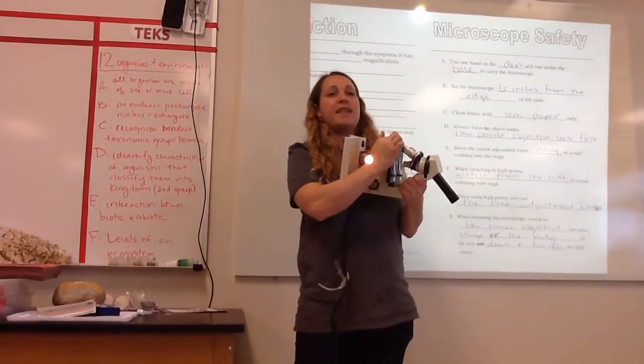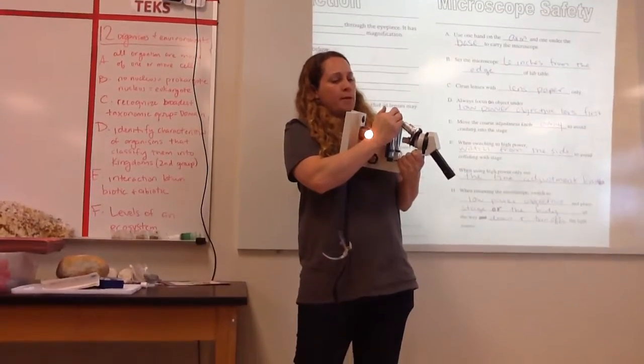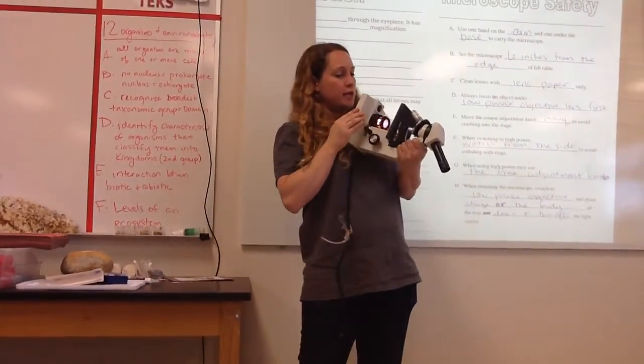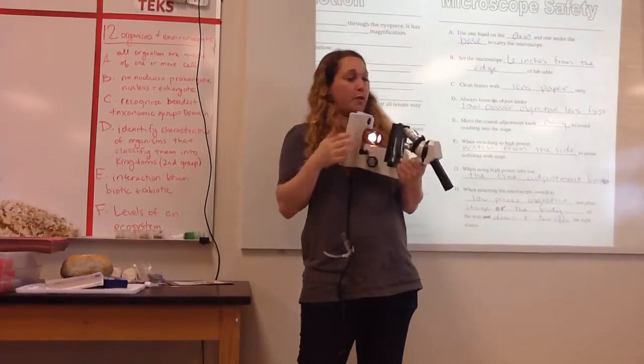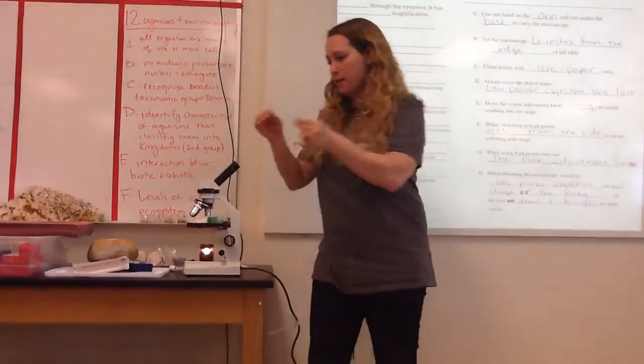So I'm looking, and it was set in the middle. No light was going through, so that's why it looked black. So I'm going to set it to a medium-sized hole. I heard it click. I'm looking and the light can be seen through it. So that means it's good to go. All right, put it back safely. Now that it's stable, I can put the slide back on.